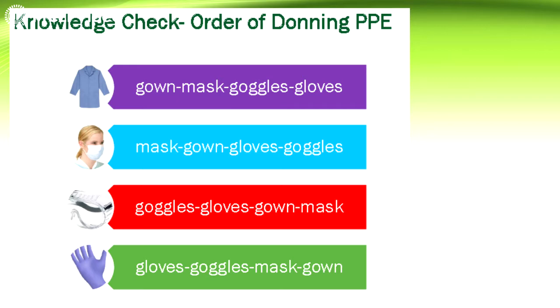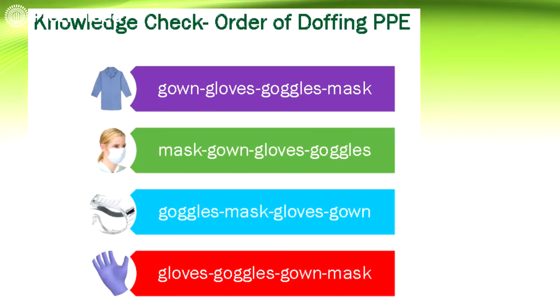So, another thing is, after putting on the PPE, of course, you have to remove the PPE, di ba? So, ano ba yung proper way of removing the PPE? So, kapag removing the PPE, the first thing you're going to remove is actually your gloves. Gloves dapat. Followed by the goggles, the gown, and the mask. So, that is a proper order of doffing the PPE.